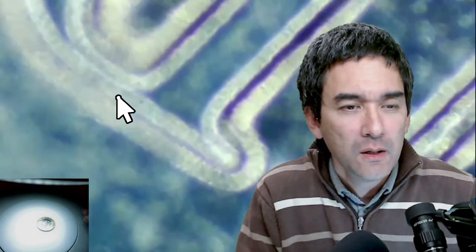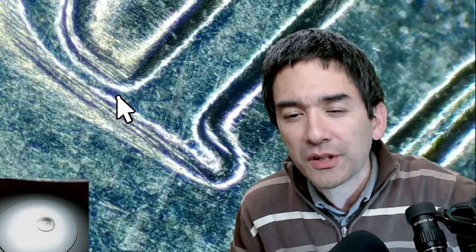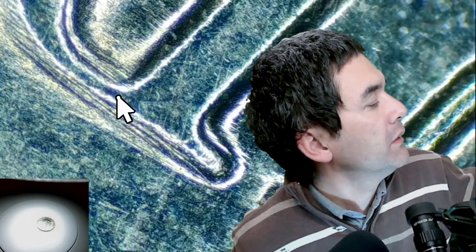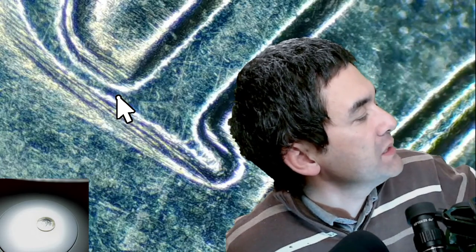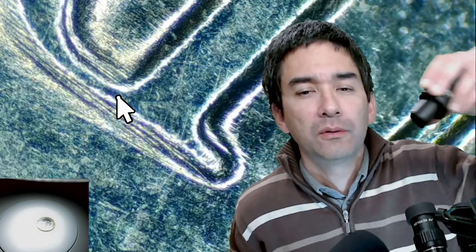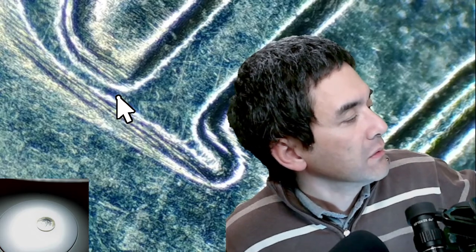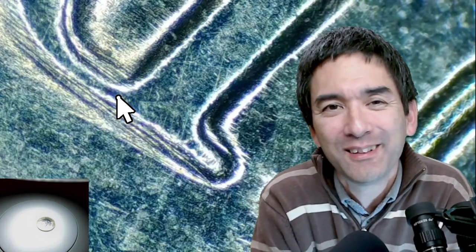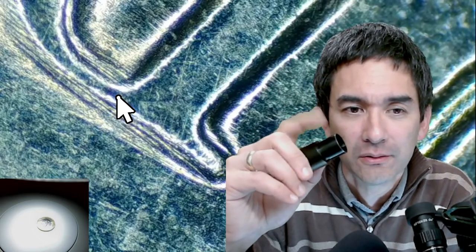On the Olympus eyepieces from the last live stream: these are 10x magnifying eyepieces with a large field of view — they are proprietary Olympus eyepieces. The big companies define their own standards, so these are not the standard diameter. My older Olympus microscope did have standard diameter eyepieces.